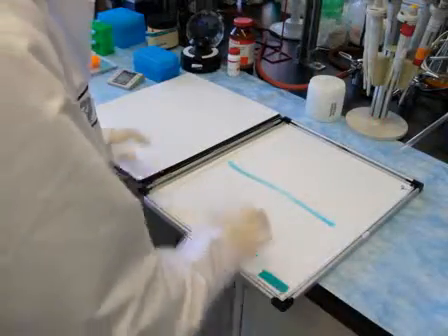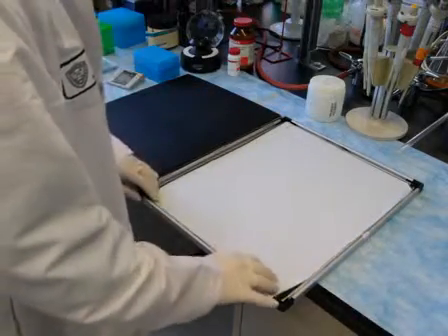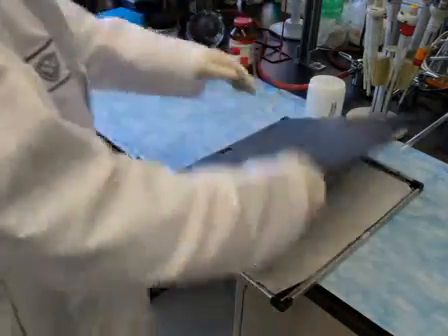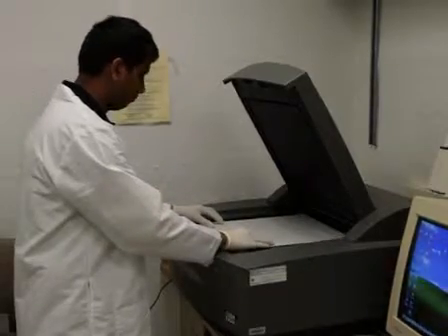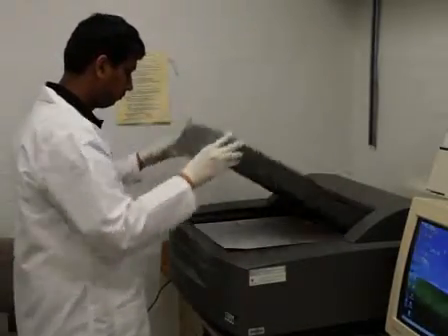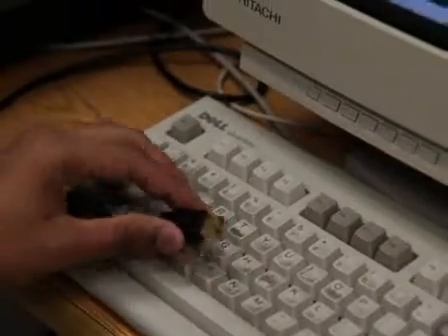Expose the dried gel to a storage phosphor screen overnight. Scan the phosphor screen with an imaging system for filmless autoradiography. Then, transfer the gel image file to the computer for analysis.